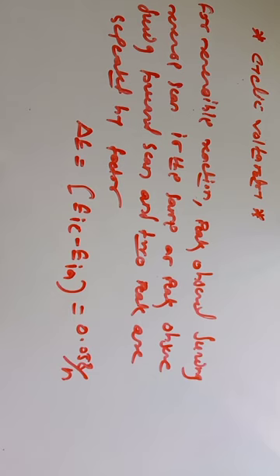At least you should know this about cyclic voltammetry. It is also known as triangular wave voltammetry. In this voltammetry, we measure the current by applying the potential, but the potential is scanned from the forward direction to the reverse direction, from more positive to more negative potential.